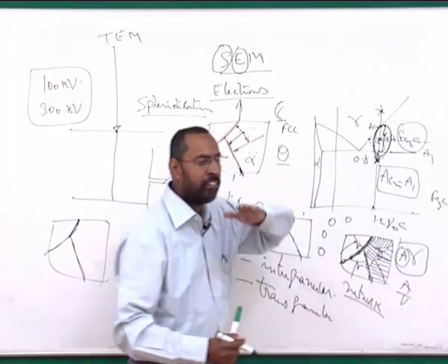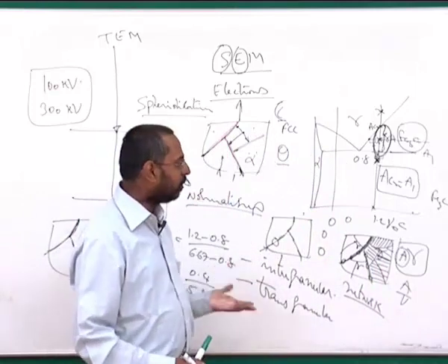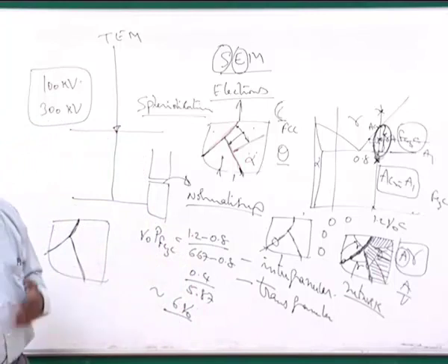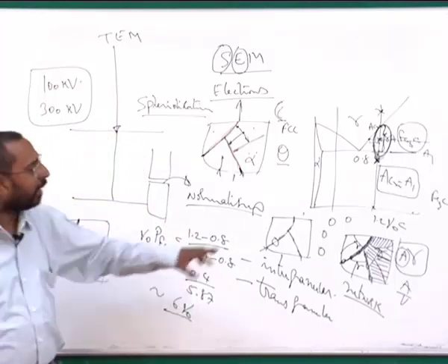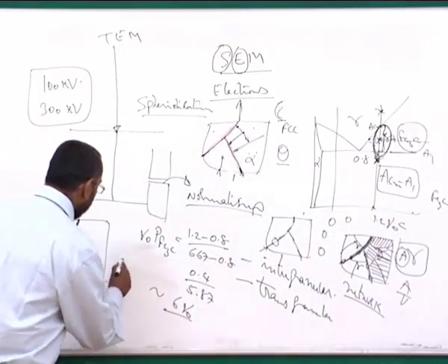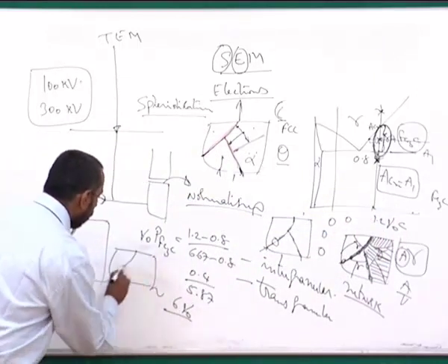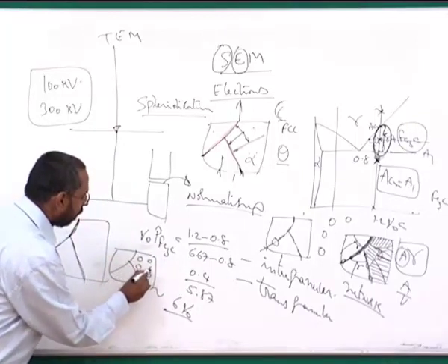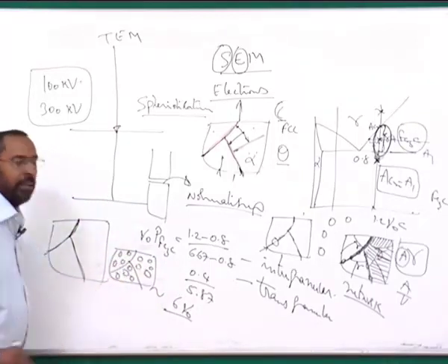These are also sheets of cementite, and these sheets also have a high surface area, and as a result high surface energy, and that cementite also can get converted. Hence you may end up ultimately with a structure where you will have completely spherical particles of cementite everywhere.